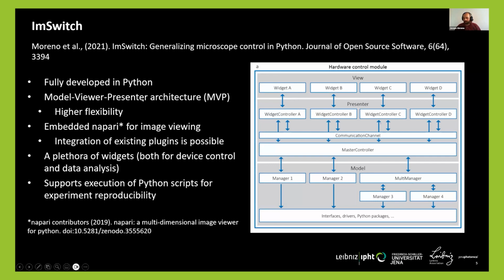But I can already say that this provides a higher flexibility in terms of how to create setups and how to manage different setups with the same code base. One nifty thing is that it uses Napari for image viewing, which is becoming one of the most contributed-to open source software packages right now for image processing.